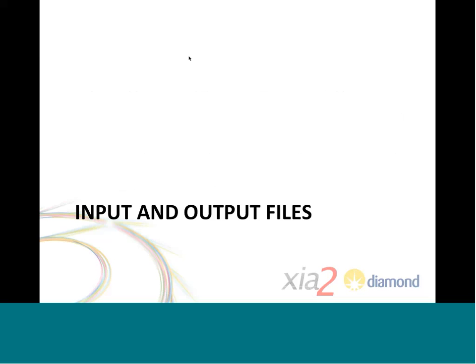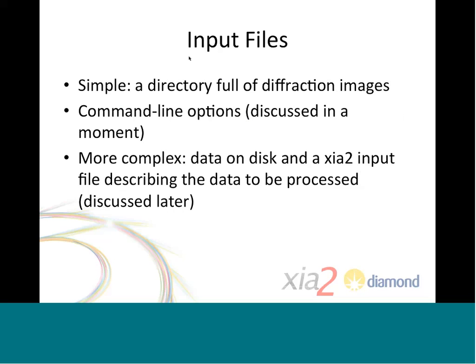Okay, so to start with a bit of talking about input, the most simple usage, and I would say the most common usage of XIA2, is just to have a directory full of diffraction images, run XIA2 and point it at that. That is pretty much the way I normally work with XIA2. There are some command line options that you'll use on a day-to-day basis, which I'll cover in a moment.